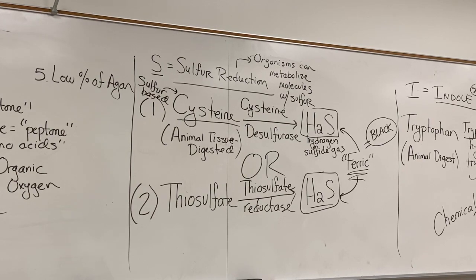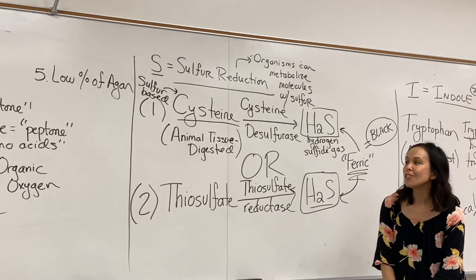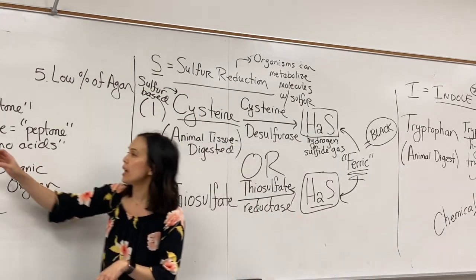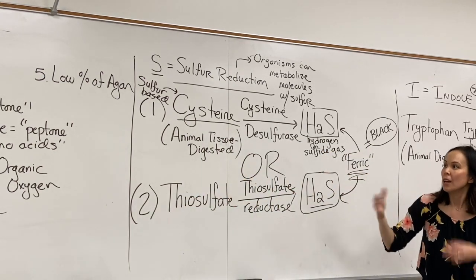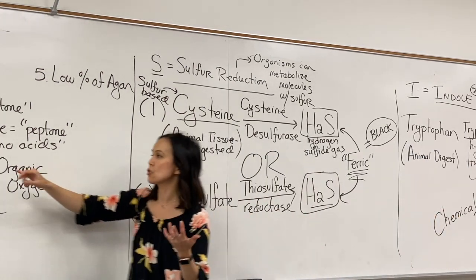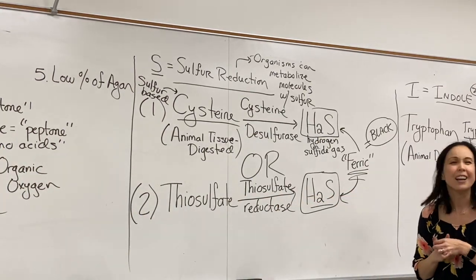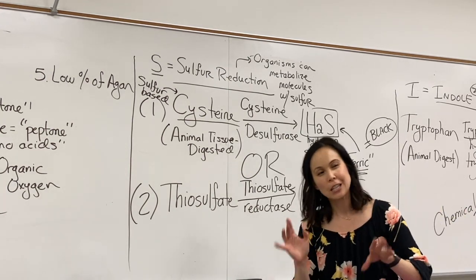Can you explain the difference between the digestive casein and the digestive animal tissue? Because it says both as peptone. It's both peptone. I think the reason they added the extra is, theoretically it should be the same, but I guess it's just in case there's not enough cysteine in the casein to do the animal tissue. So the milk protein might cover it, but they add the extra just in case.